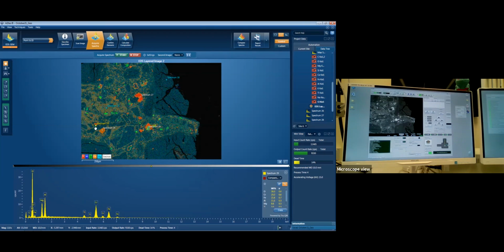So again, we've got that aluminium chromite happening. So it's chromite, iron, aluminium, and a bit of magnesium and titanium, which is a pretty standard composition for these sorts of things. Like I said earlier, you can fit a lot of different elements into a crystal structure if you try hard.